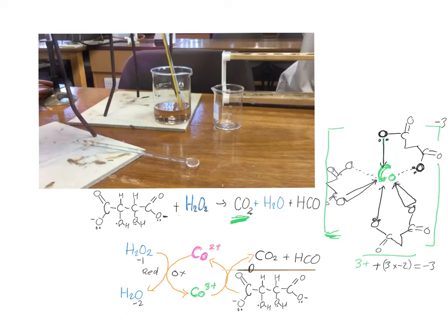And as the effervescence subsides, what is happening is these species here, this complex ion surrounded by 3 bidentate 2,3-dihydroxybutane dioate ions, starts to break down. So you can now see that the effervescence has subsided, and then all of a sudden, as the effervescence subsides, you can see the colour changes, these disappear, and we get the cobalt 2+ ions returning.